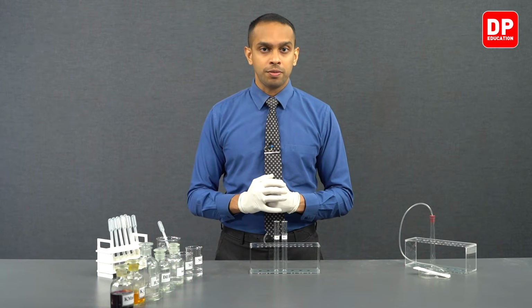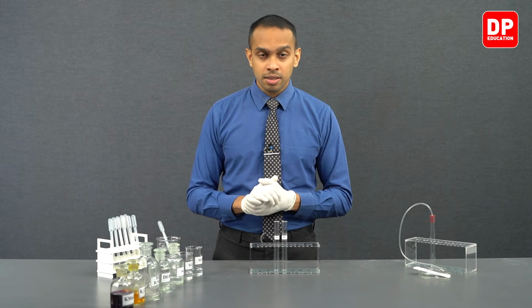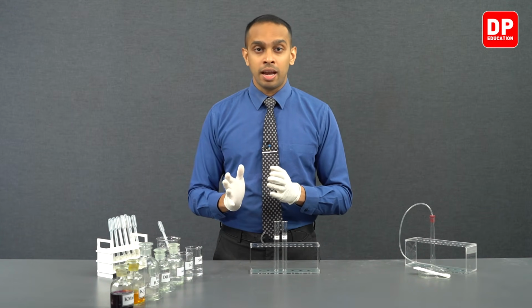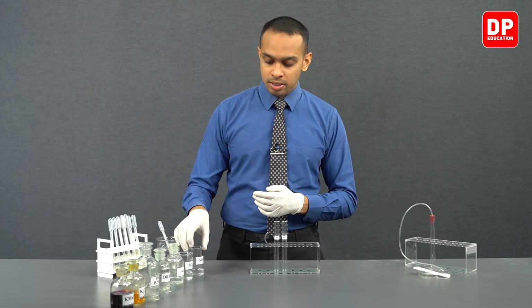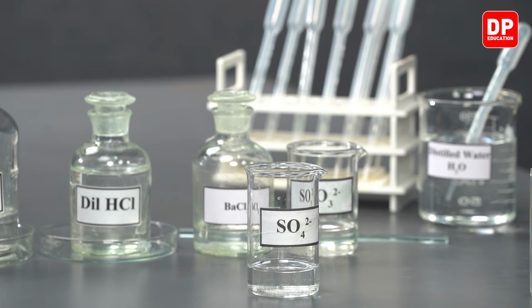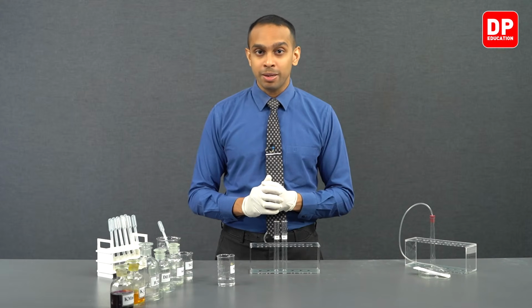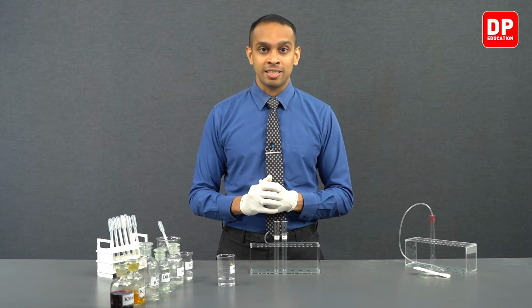In the first part of our experiment, we are going to observe how to identify sulfate and sulfite ions. We have our sulfate ions here. We are going to first use barium chloride to identify ions in a solution.